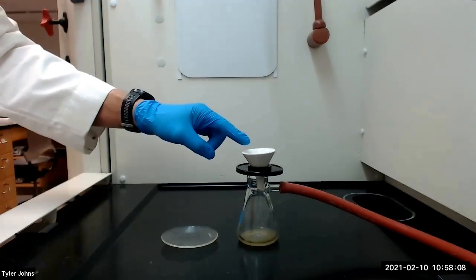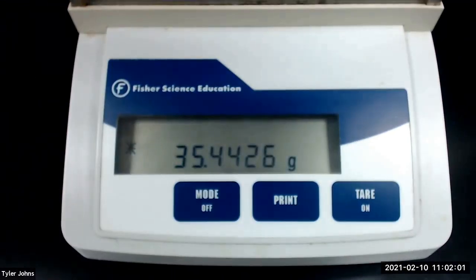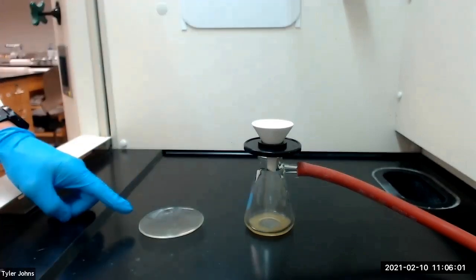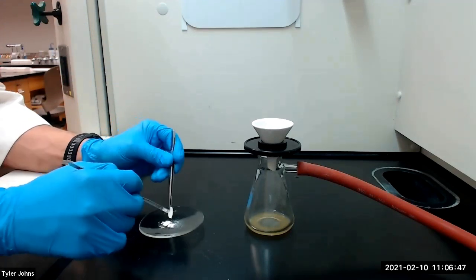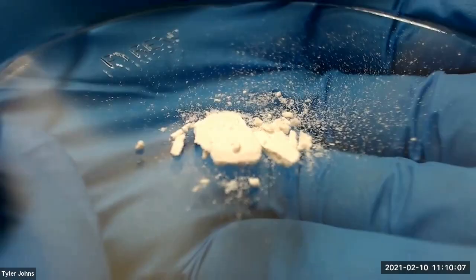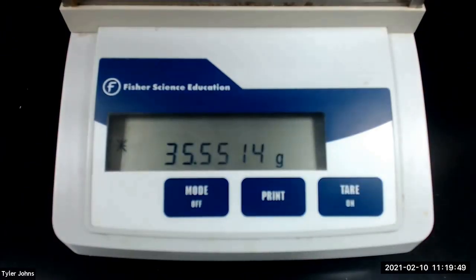While our purified hexaphenylbenzene product continues to dry, we will next pre-weigh a watch glass. The mass of the pre-weighed watch glass is 35.4426 grams. After drying, we will collect the purified hexaphenylbenzene product on the pre-weighed watch glass. The mass of the pre-weighed watch glass plus the hexaphenylbenzene product is 35.5514 grams.